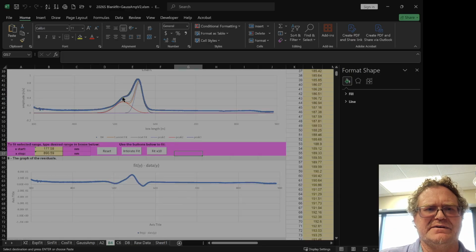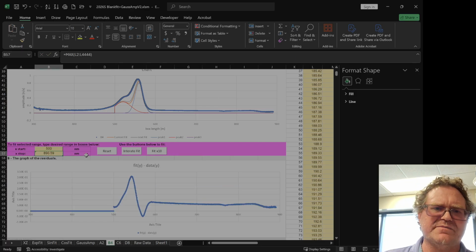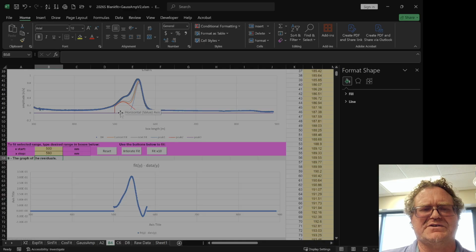And see what happens to my data right there. That looks pretty close, and I'm hoping that it will line up pretty well. But once again, I want to cut off my data, and so I want to say maybe 450 is not quite enough. I'm going to go ahead and cut it right off at 500 here. And on the other side, maybe 580. And it's okay that it cuts it off a little bit right here because there's actually some more. There's like a third peak down here. I'll show you on the next one. I actually fit it with 3 peaks. You only have to fit it with 2.